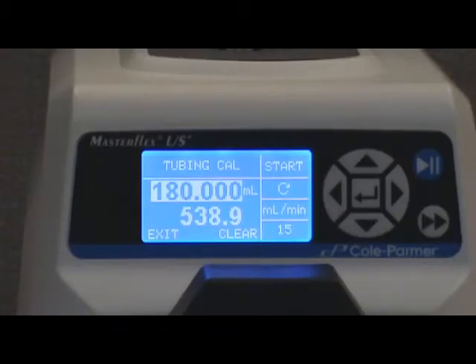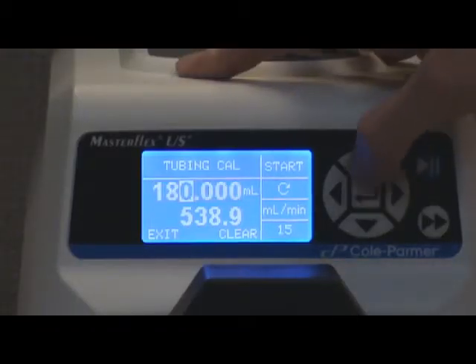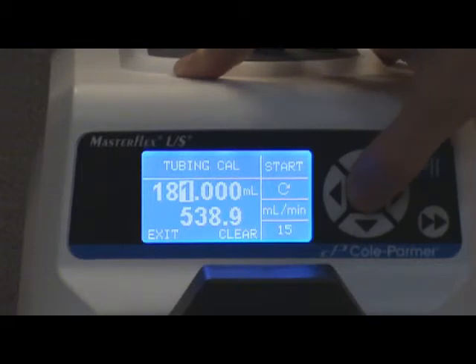This time, we got a volume of 181 milliliters. We adjust the volume as we did before and run the calibration a third time to check the pump's accuracy.